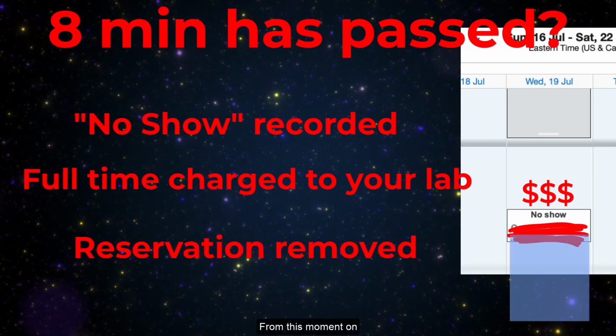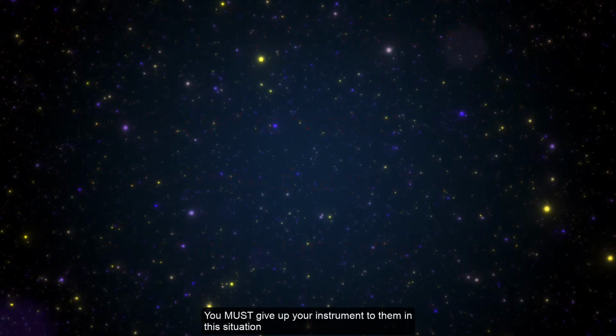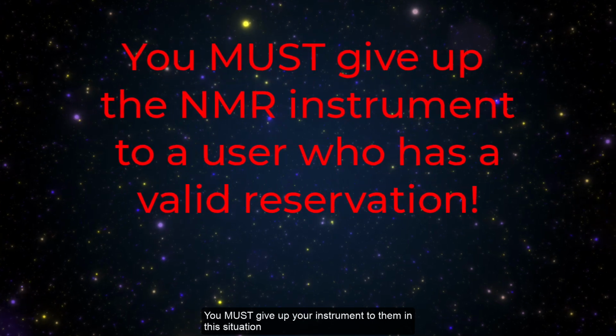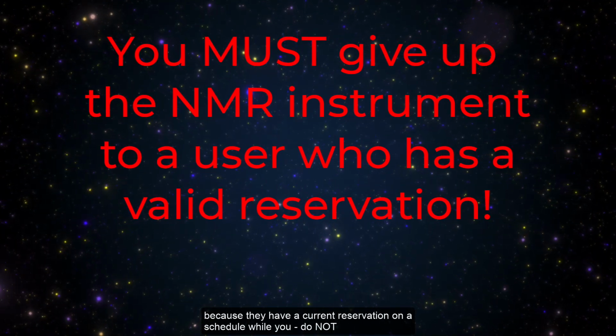From this moment on, anyone can book an NMR time and come to the room to use the instrument. You will have to give up your instrument to them in this situation, because they have the reservation on a schedule and you do not.